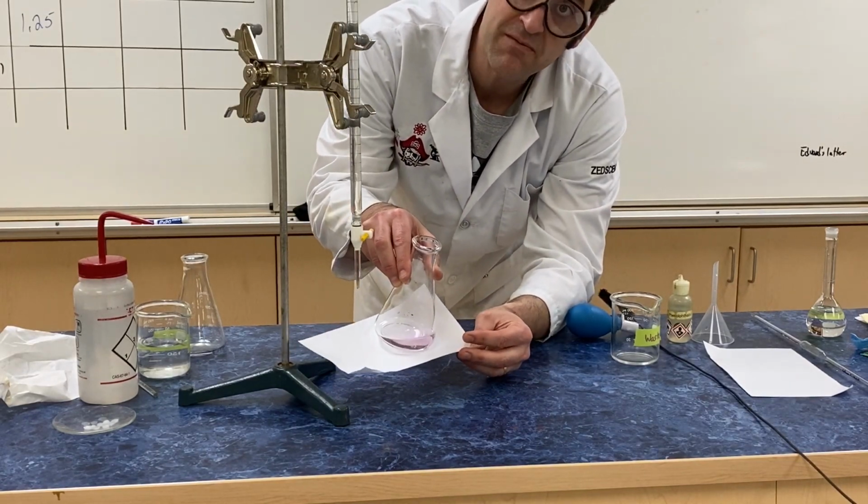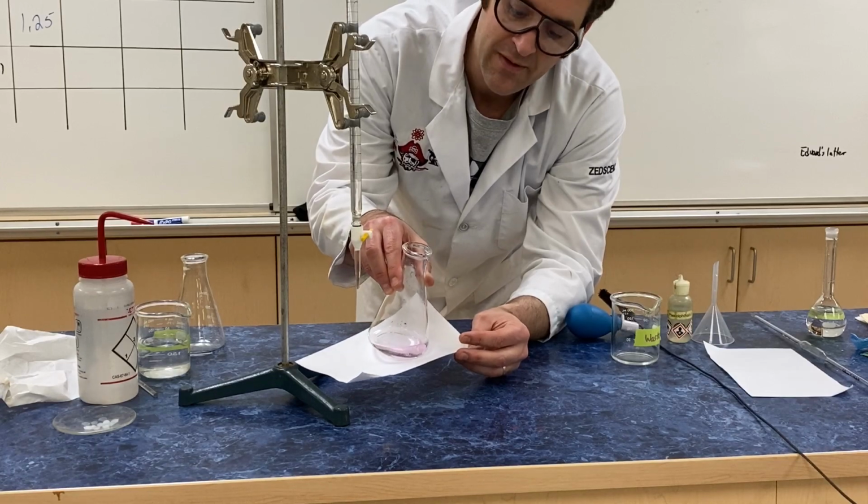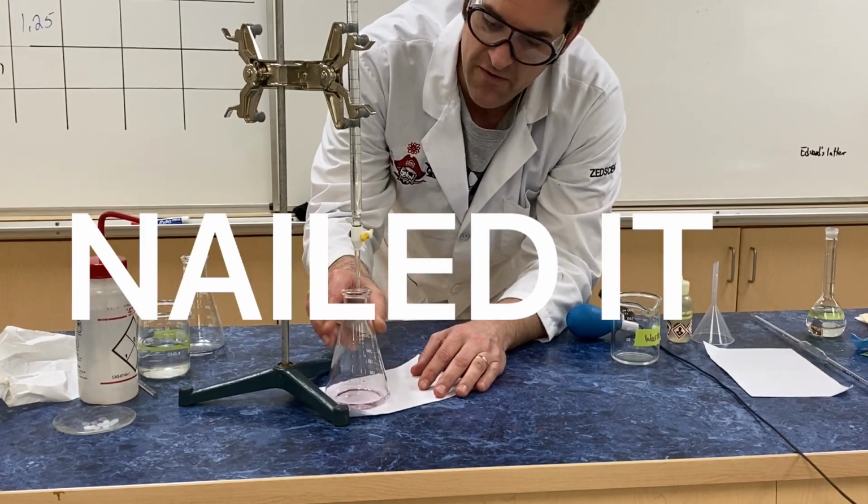Would you say to stop there, Zdog, or go a little more? I think you nailed it. Yeah, that's a nice, very faintly pink.